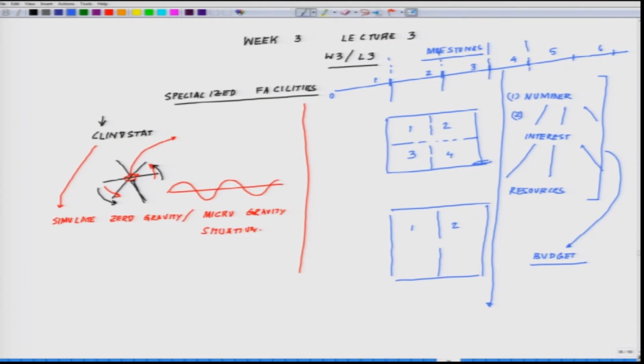So that demands that you chalk out the space reasonably well. So do not unnecessarily cover up the space with bulky stuff which you know you have to remove.